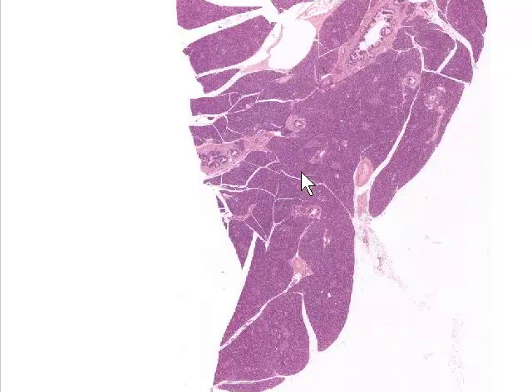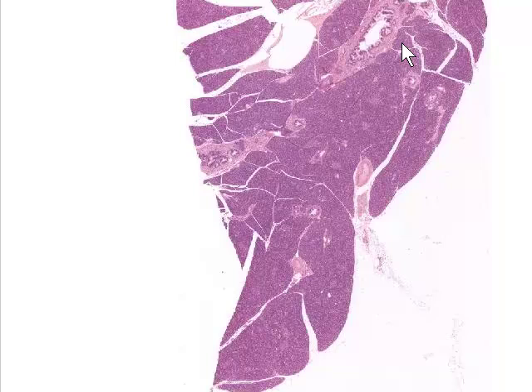The second thing, which should be fairly evident, are these large structures surrounded by pink staining connective tissue. These are either vascular structures supplying blood to and draining blood from the pancreas, or, as we see definitely here and here and here, these are large pancreatic ducts which drain pancreatic secretions into the duodenum.